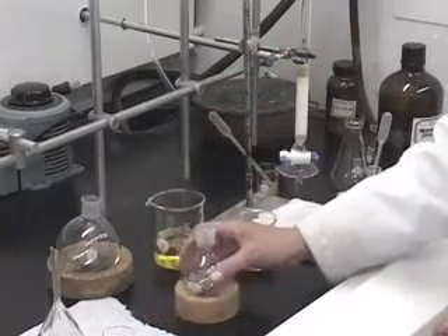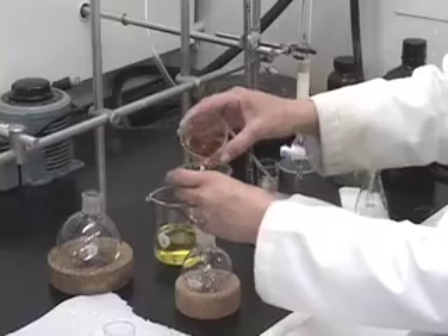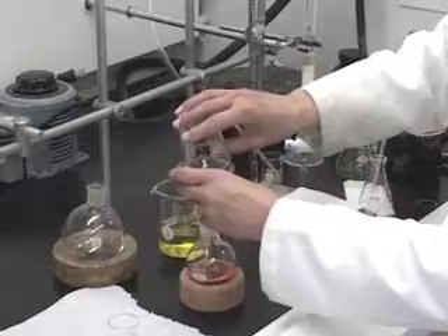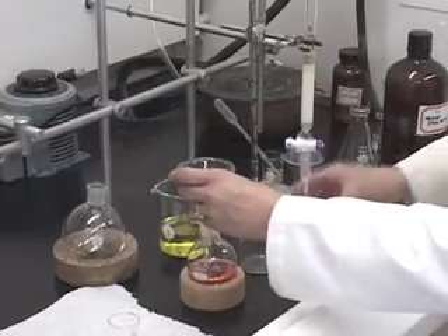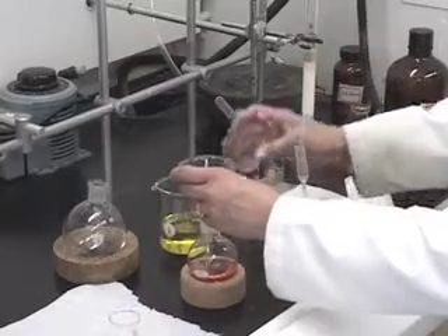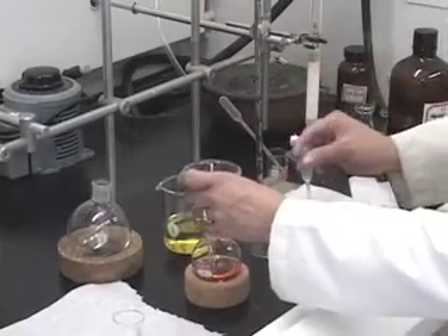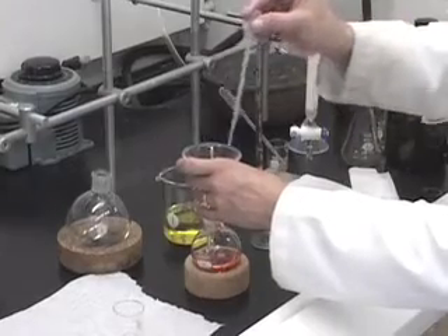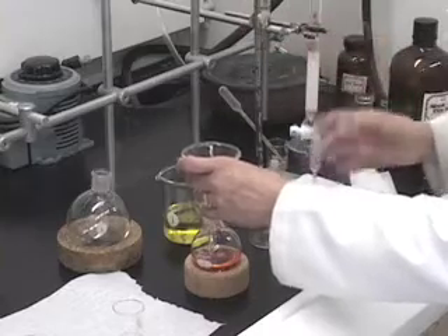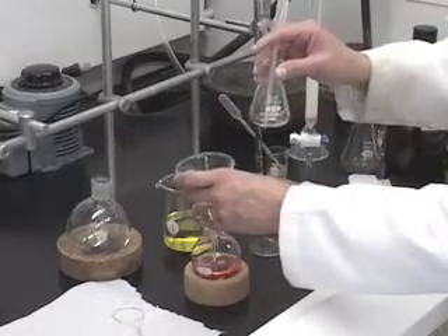What we want to do is transfer these solutions using a funnel. If you want to rinse the beaker with a few milliliters, the rinsings go through the same funnel. Then rinse the funnel itself with pure solvent — which solvent you use for rinsing is really irrelevant. For the second fraction, I used the more polar solvent, one to one.